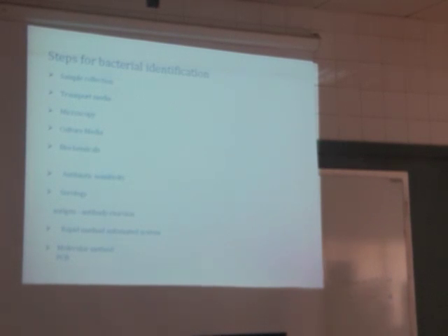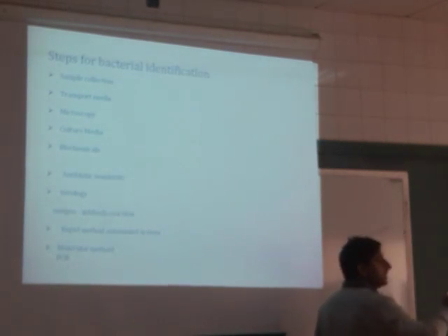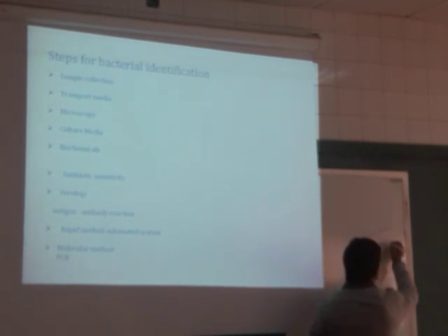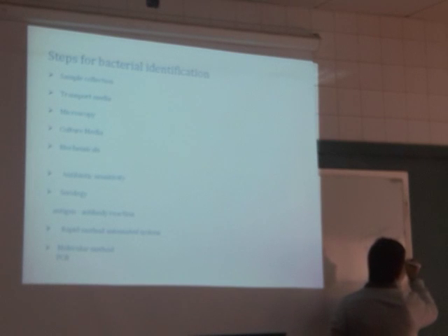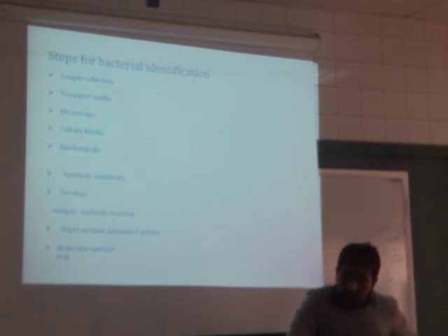Do not forget these points. In microbiology, what is fermentation? Fermentation means breakdown of sugar. Sugar can be glucose, lactose, very good, fructose, and also mannitol. Mainly we are using these types of sugars. So in microbiology terms, we call it fermentation.